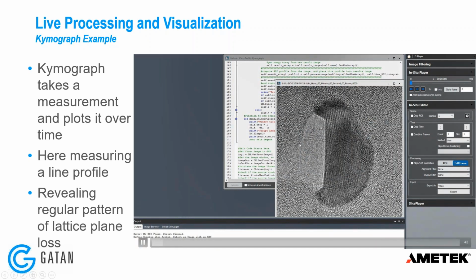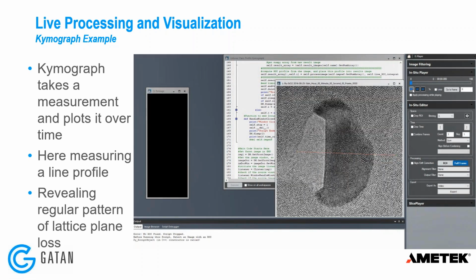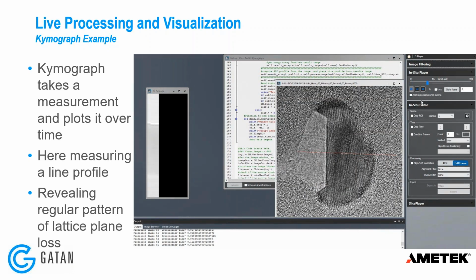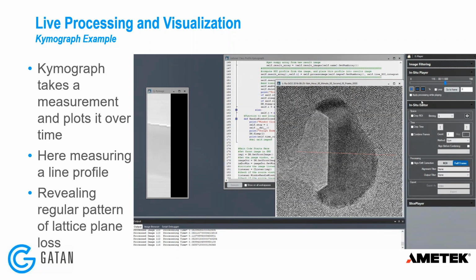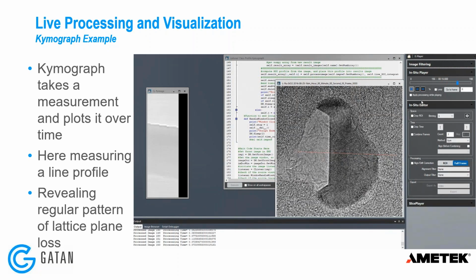And that width is defined in my Python script. But here I'm showing a video of me actually running this script. So I've created my ROI. Now I start my Python script, and then start playing this data back. This is data that was already collected, but I could just as easily have used this script with a live display of data during acquisition.